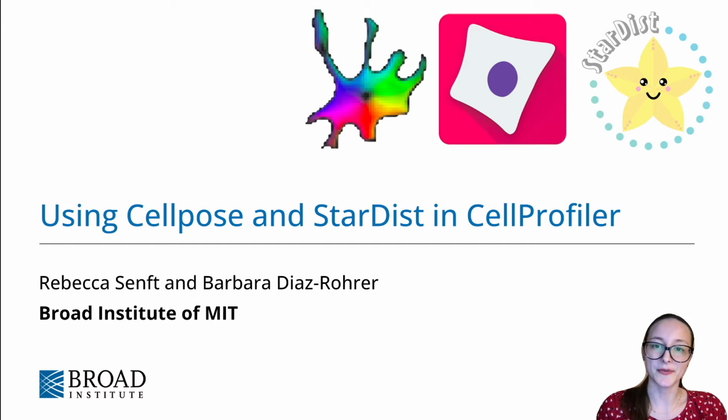Today we'll walk you through some new plugins that are available for CellProfiler to allow you to use Cellpose and StarDist models for segmentation within your CellProfiler pipelines.